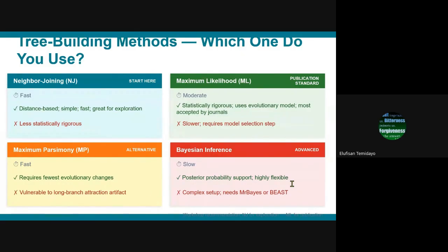So I don't know, maybe we have this sequence already. I think this is the sequence that is being used throughout this training. I want us to copy this sequence and do a BLAST search, and then I'll be doing the same thing. I'm going to show you what I have. Then we're going to download just a few. We're going to copy out a few nucleotides from there, which we want to use as our training guide. I'll be explaining along the line as we work together on my screen on MEGA. So please, if we have it, we can always do a BLAST, and then I will tell us what to select.